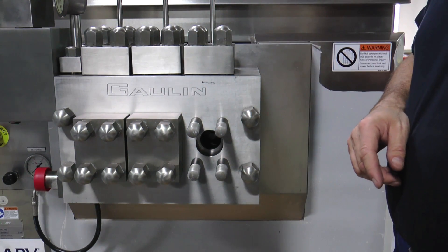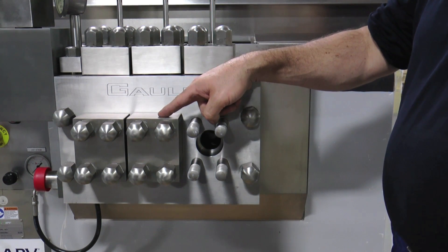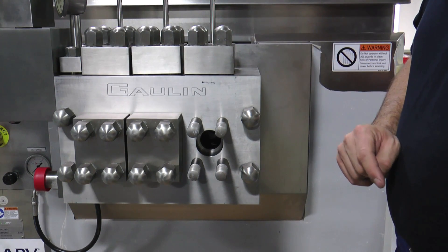For training purposes, only one plunger position is being demonstrated in this video. In a normal maintenance situation, all plungers should be checked by following the same procedure.